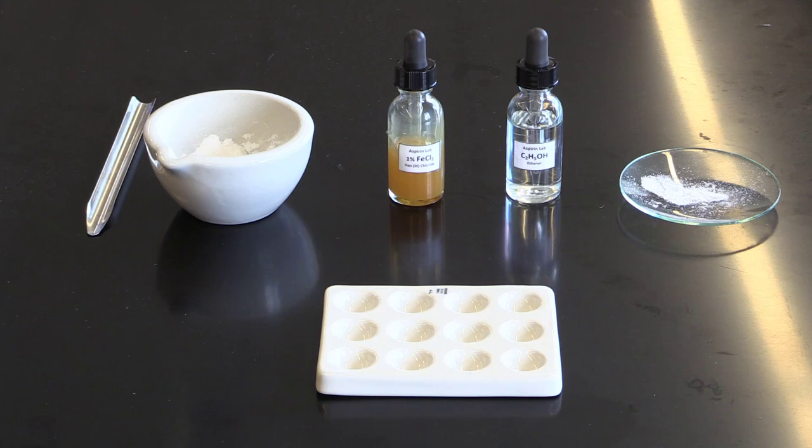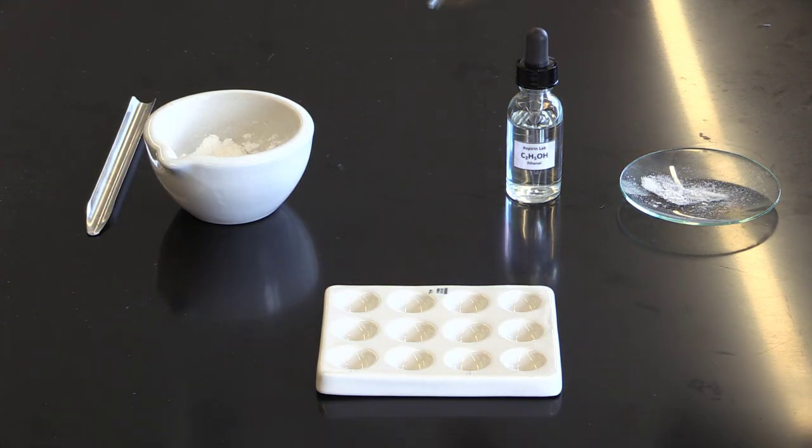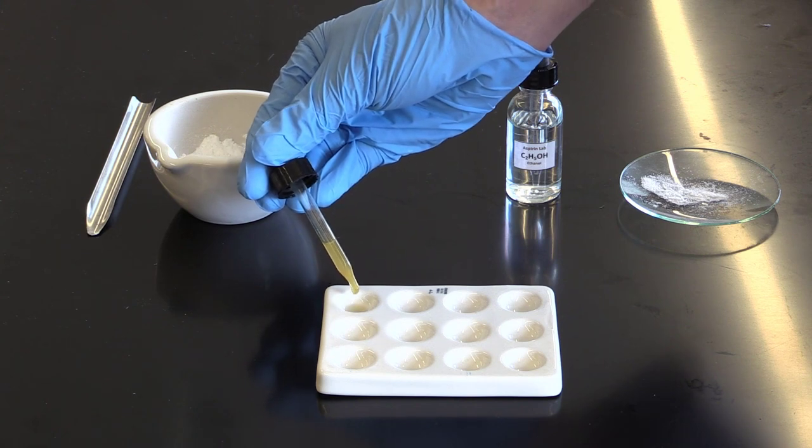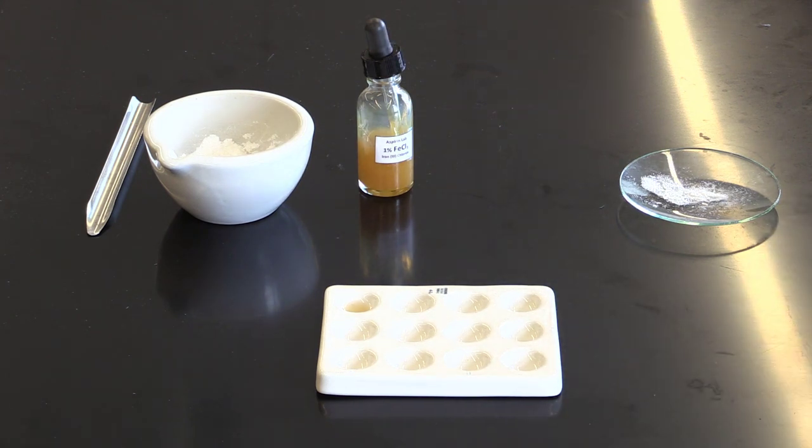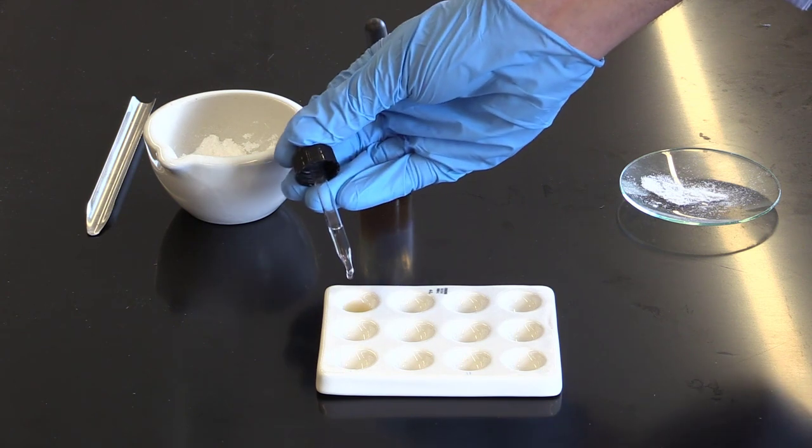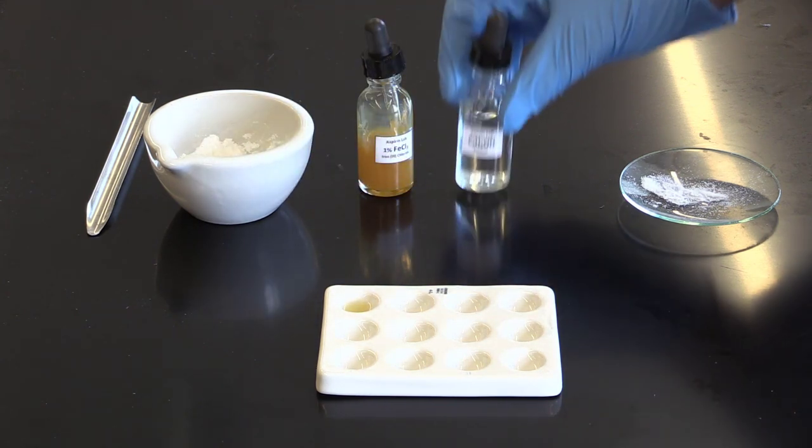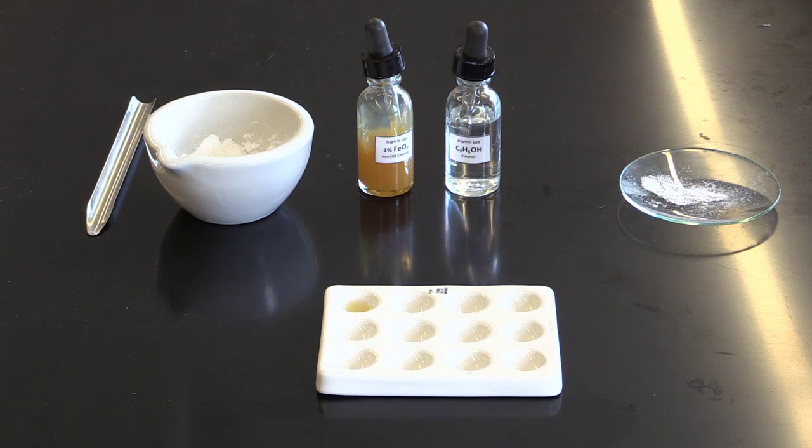The first thing we need to do is make sure that our ethanol is not contaminated. To do that, in the first well we are going to take our iron 3 chloride and our ethanol. If our ethanol is not contaminated, it should stay yellowish brown, which as you can see it is, meaning our ethanol is not contaminated.